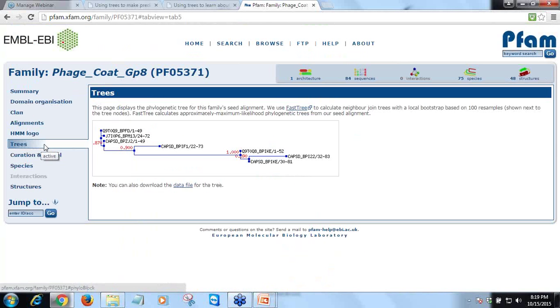Now what we are going to do in here is use the seed, a small subset of FASTA sequences, made available to us as seed.fasta. Using the BioPhylo module, we are going to generate a seed tree which should ideally match the tree showcased here on this particular website. So let's see how to do that.